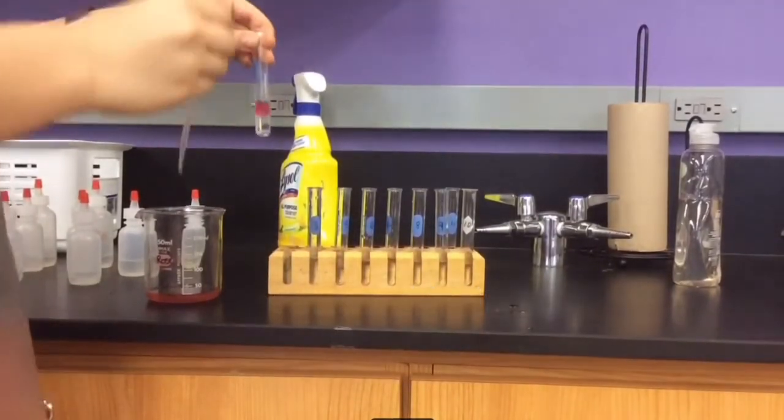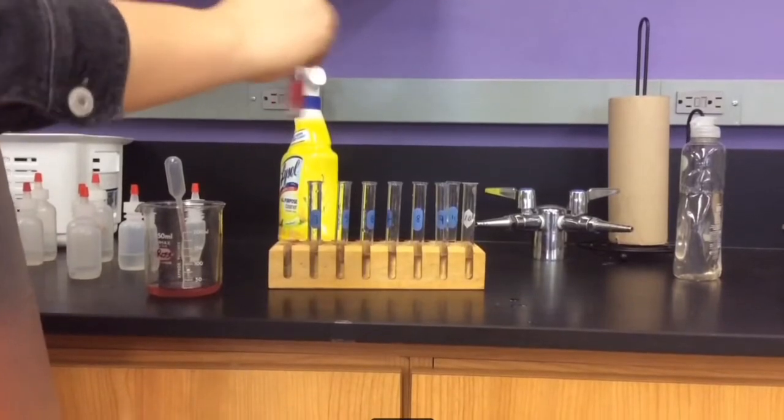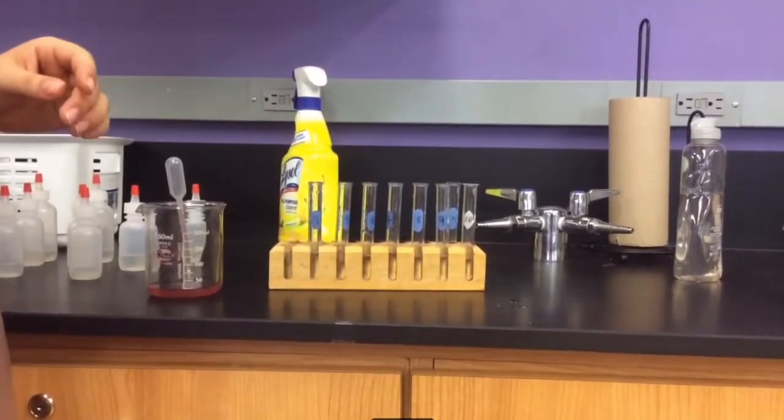Put 20 drops of the pH solutions in the test tubes. Add 10 drops of the indicator to each test tube. Observe the change in color.